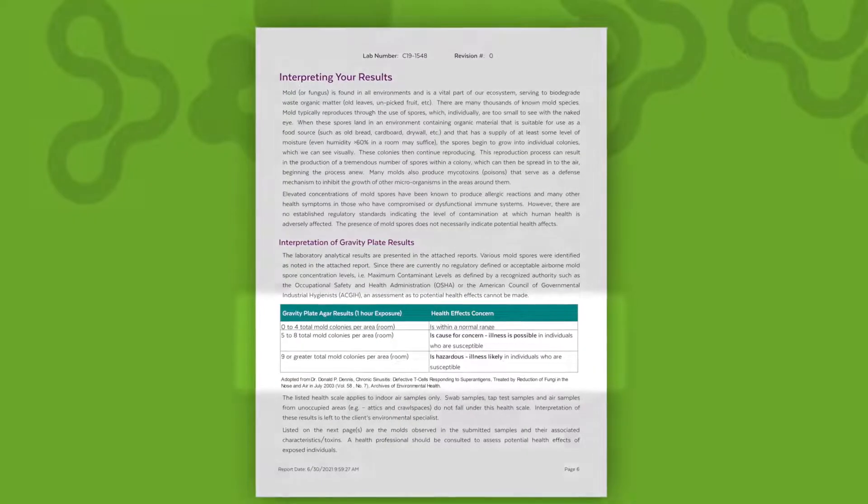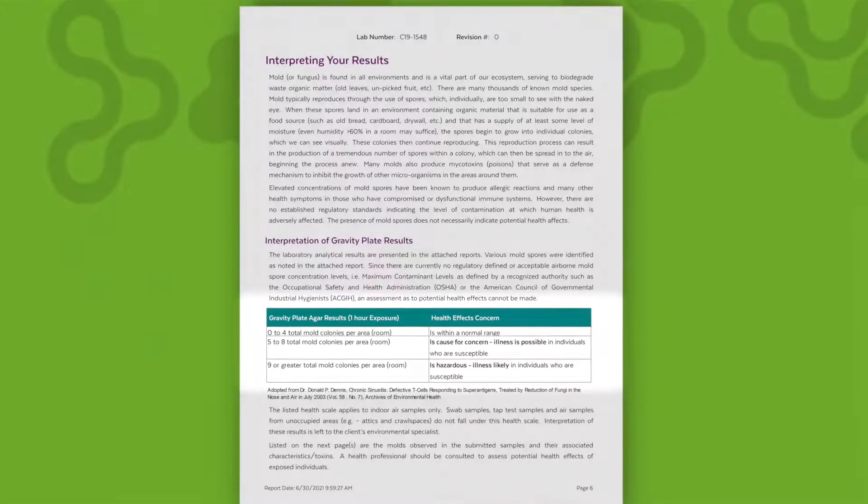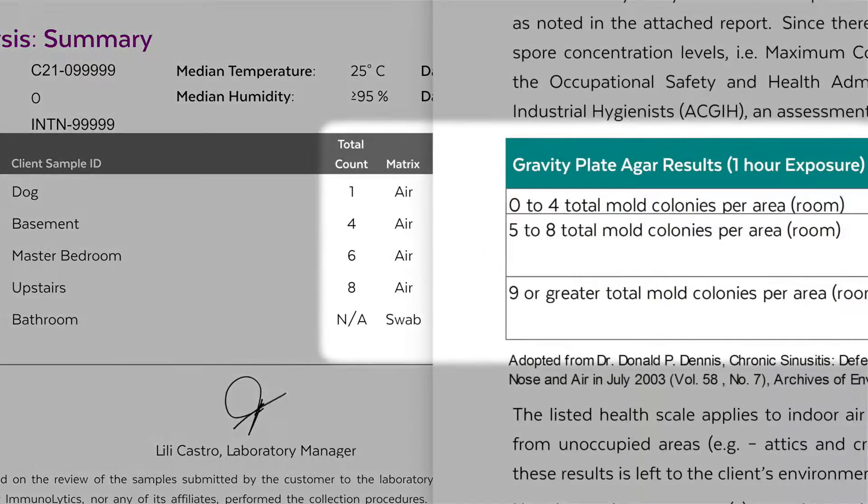On the next pages are the interpretations of the results. We'll begin with interpreting gravity plate or air results. In the middle of this page is a table that includes a health scale that is corresponding to the air samples. Use this table by comparing the total counts for each air sample in the previous section of this report.